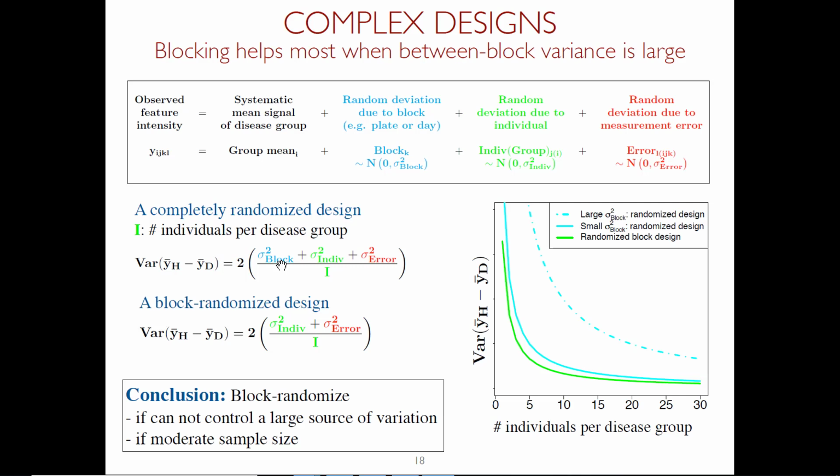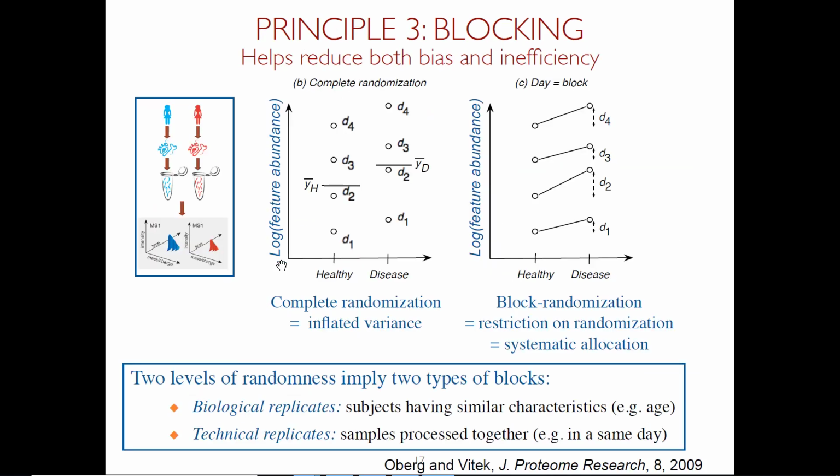But then you need to have multiple runs, right? So let's say you have 10 labels, 10 conditions. You have one sample from each condition, exactly. But then you have another run, and you have a second set of replicates from each condition. So what you will do is exactly like what I have here.